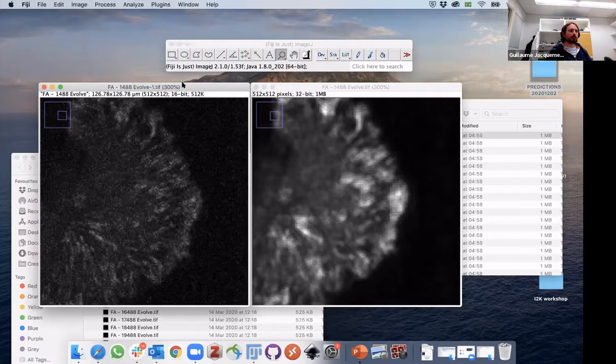Noise2Void, and especially the ones that we have here, is very good at denoising noisy confocal images or EMCCD camera images, where you have a really random pixel noise. But as soon as the noise is structured, it will completely fail and identify the structure as being signal. For that, CARE is much better, or a variation of Noise2Void specialized for recognizing this kind of structural artifact.